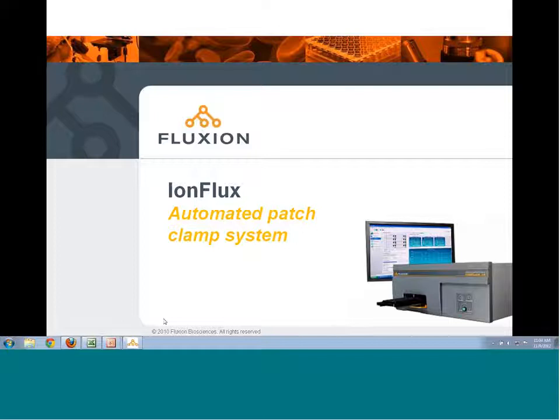But I do want to take you through the software and how we control it. To start with, I was going to do an overview of the IonFlux automated patch clamp system so that you can understand the control of the system in the context of the experiments that will be run.